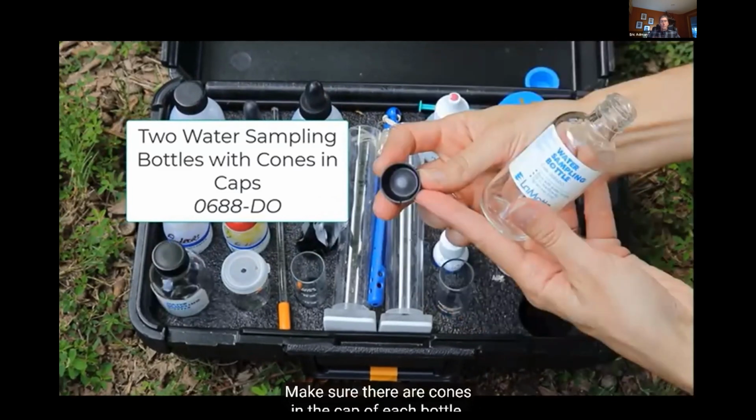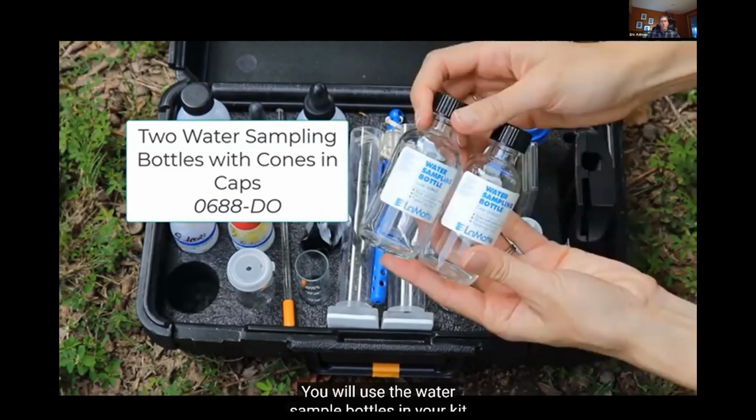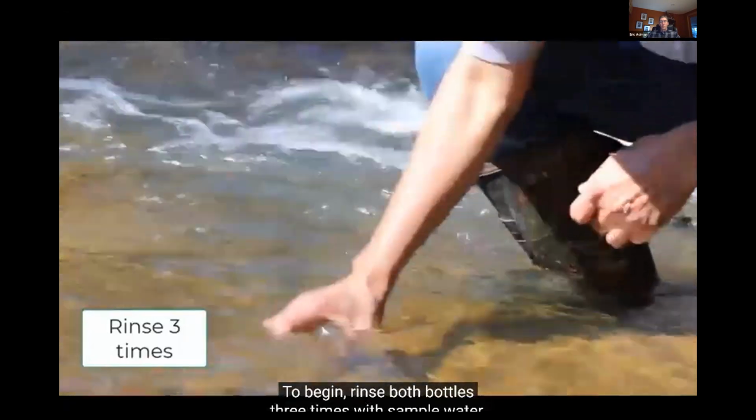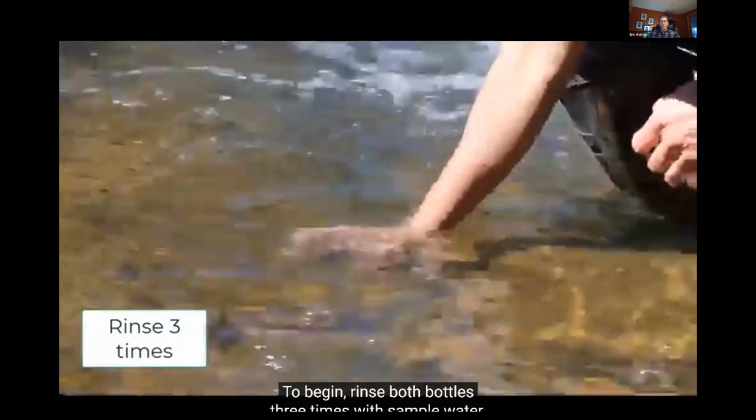Make sure there are cones in the cap of each bottle. You will use the water sample bottles in your kit to collect 2 replicate water samples at the same time and place in the water body. Collecting 2 replicate samples, also referred to as reps, ensures precision. To begin, rinse both bottles 3 times with sample water.